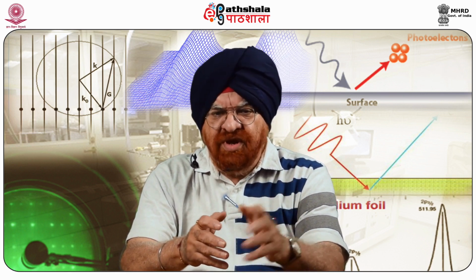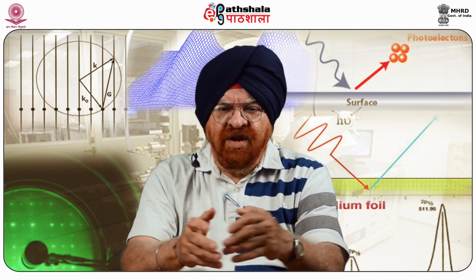The following shows a schematic spectrum with elastically scattered electrons with an energy loss of about 0 milli electron volts, that means practically no energy loss, and inelastically scattered electrons at two stages of energy loss.